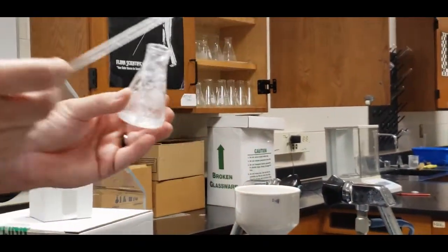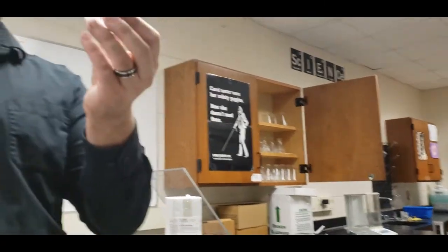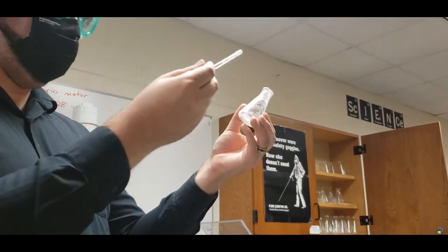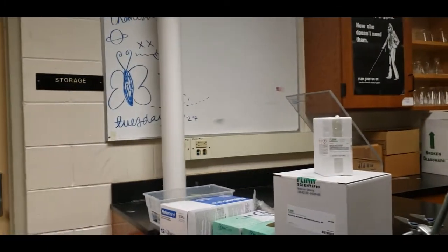Okay. Now, we could theoretically leave it like this. However, look at how much stuff this is. Okay, this is a lot. We're going to go ahead and wash it.